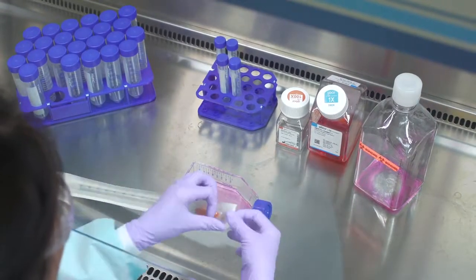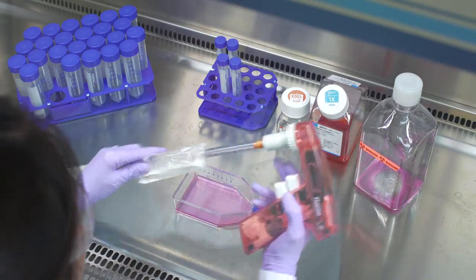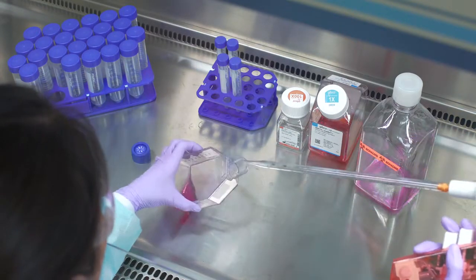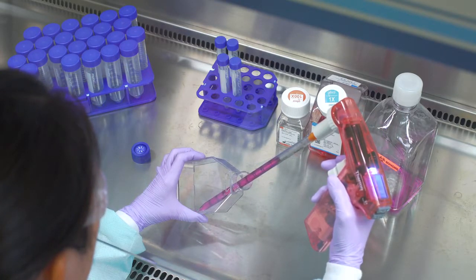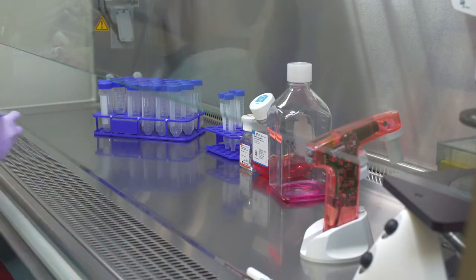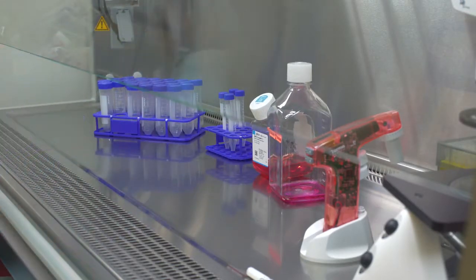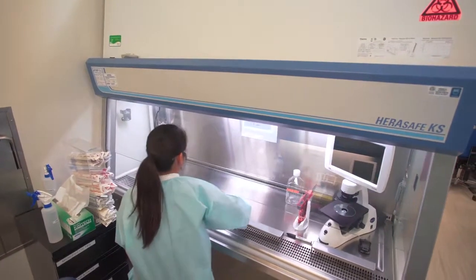When passaging cells or changing their medium, the basics of aseptic technique are the same. Only open the containers in the sterile field. Do not cross your arms or other items over an open flask. Don't rush, but work at a good pace and with deliberate motions. Do not reuse pipettes and do not use items that were inadvertently contaminated. When finished, make sure everything is closed tightly before removing items from the cell culture hood. Anything opened outside the sterile field will now be non-sterile and should not be used for cell culture work. Wipe down the work surface with ethanol again and straighten up the hood before you leave.